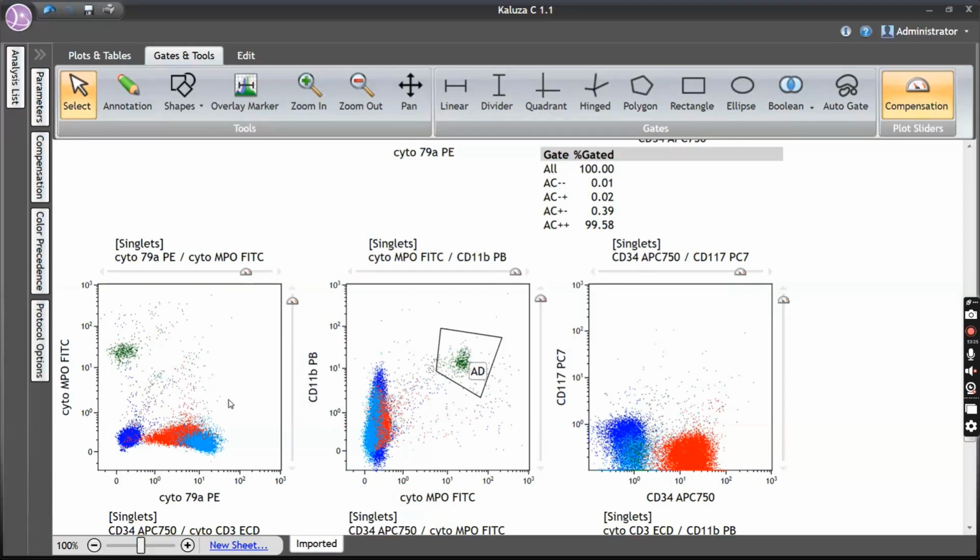Okay, what else am I missing? CD73 is again overexpressed, that is, it is positive. Among the myeloid markers, only CD66c is positive in a very dim fashion, dim to negative. The other myeloid markers are negative. It is negative for all the T cell markers. It is positive for another B cell marker in the cytoplasmic tube, which is cyto-CD79a. So this is a case of B acute lymphoblastic leukemia.